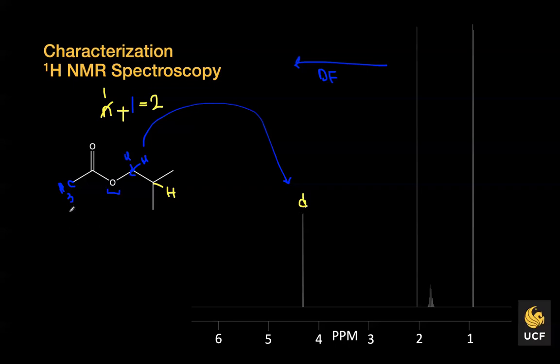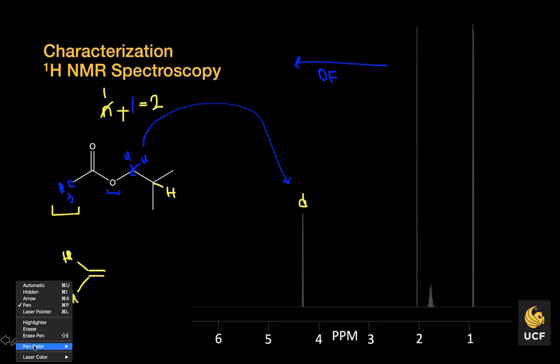And then you would do the same for everything else. So we're going to just take a look at that. Those 3 hydrogens on the same carbon have the same exact environment. Sometimes hydrogens on the same atom have different environments. When you have something like an alkene and you have protons across an alkene, you can't rotate around a carbon-carbon double bond. So the protons across an alkene, this hydrogen and this hydrogen, do see slightly different environments, right? Think about it, you can't really rotate around that carbon-carbon bond, so those two hydrogens could see different environments. But in the case of a carbon-carbon single bond, they're exactly the same, right?